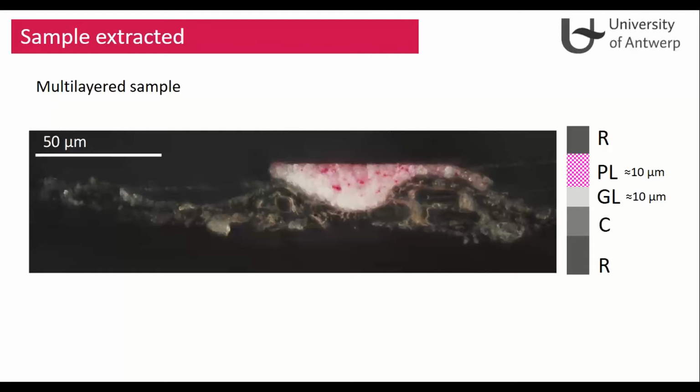So the thickness of the painting layers is unusually thin. Normally you can find much thicker layers than this. In this top layer, you can see these thin particles I was mentioning. They are quite small, around 2 micron diameter. And these are the bigger ones, because we can see that there are areas where the particles cannot even be distinguished in the microscopic image.